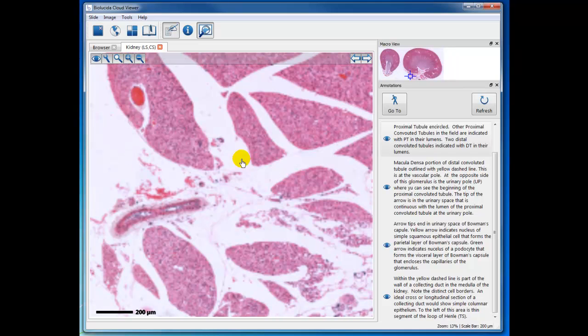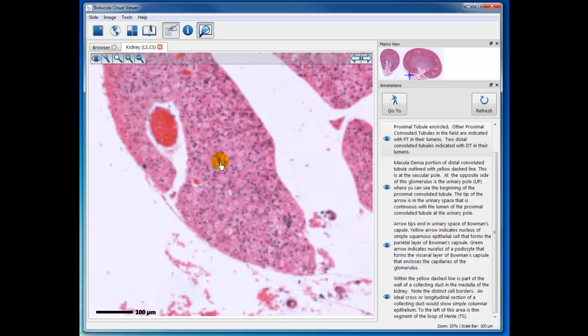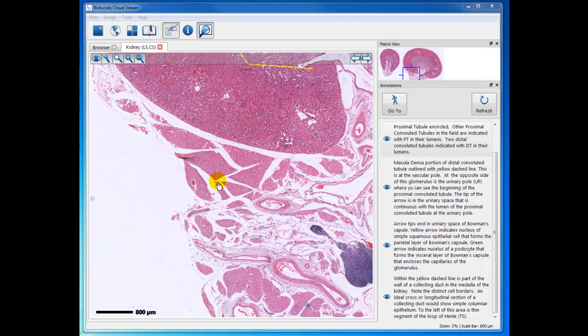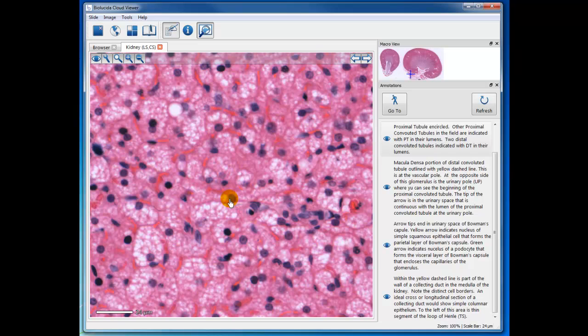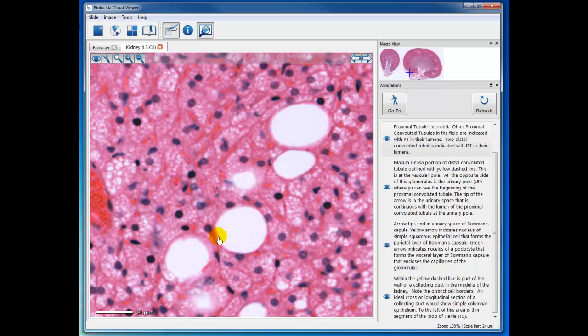Now, I guess before I leave, one other thing. What is this tissue here? So this tissue that we're looking at is multilocular or brown adipose tissue. You see the multiple lipid vacuoles in each cell rather than one big single vacuole in each cell. And amongst the brown fat, you have occasional white adipocytes, white adipose tissue cells.